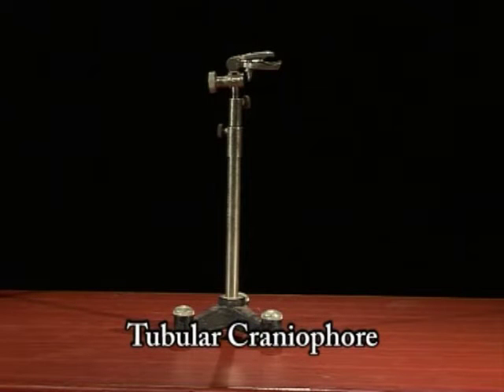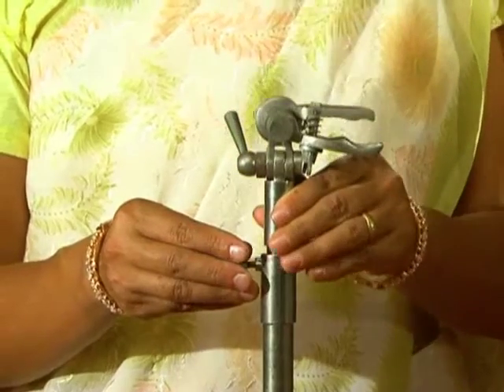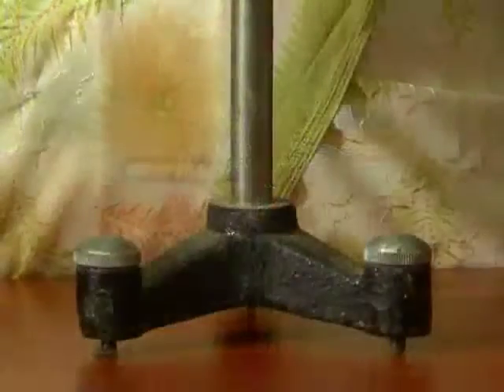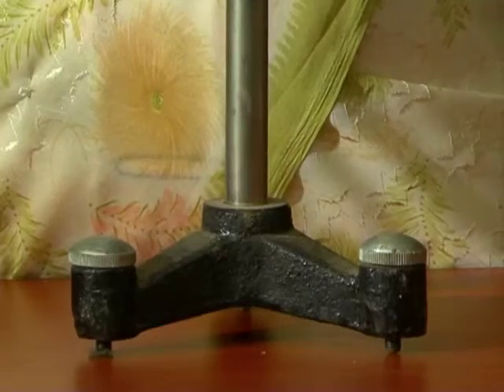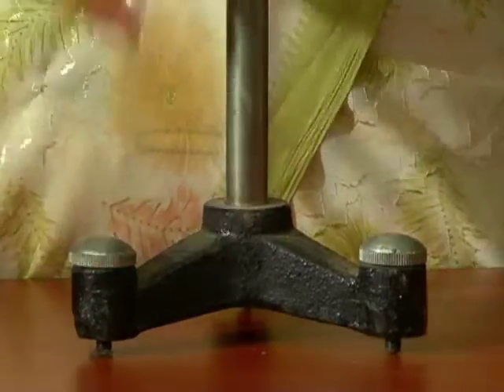Tubular craniophore. It consists of a long, hollow metal tube which slides in and out of another tube fixed on a heavy tripod base provided with adjustable screws.